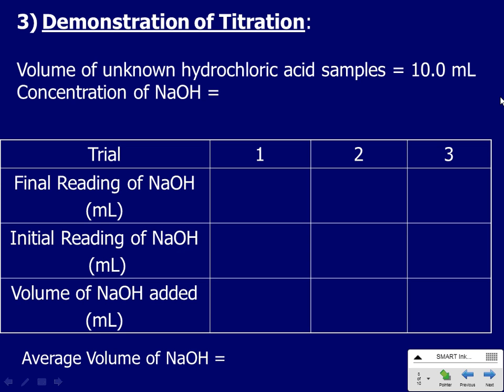Okay. And in this case, we're going to assume we know the concentration of the sodium hydroxide, and the concentration of my sodium hydroxide today is 0.50 moles per liter. All right? And we're going to pretend we don't know the concentration of the acid, but in actual fact, for my demonstration, the concentration of the acid is about the same.